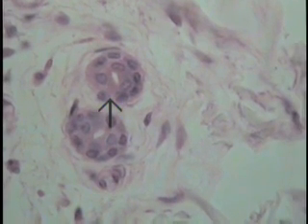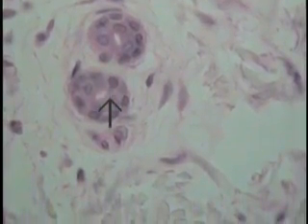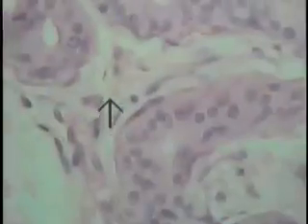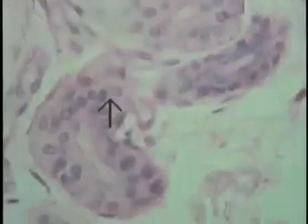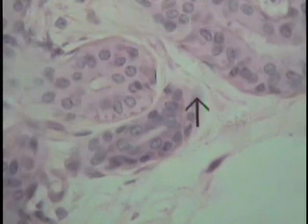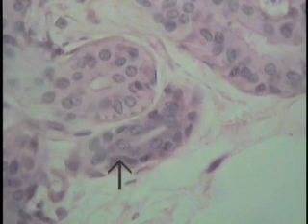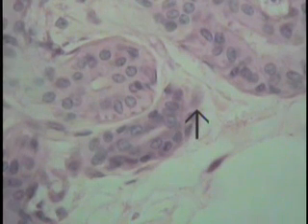It's relatively rare, and one of the classic places to observe it is in the ductal system of the eccrine sweat glands. This is the sweat gland here, shown at increased magnification. We just have a nick through our tangential section through the ductal system, and once again you can see even at this high magnification it is still lined by a typical stratified cuboidal type of epithelium.